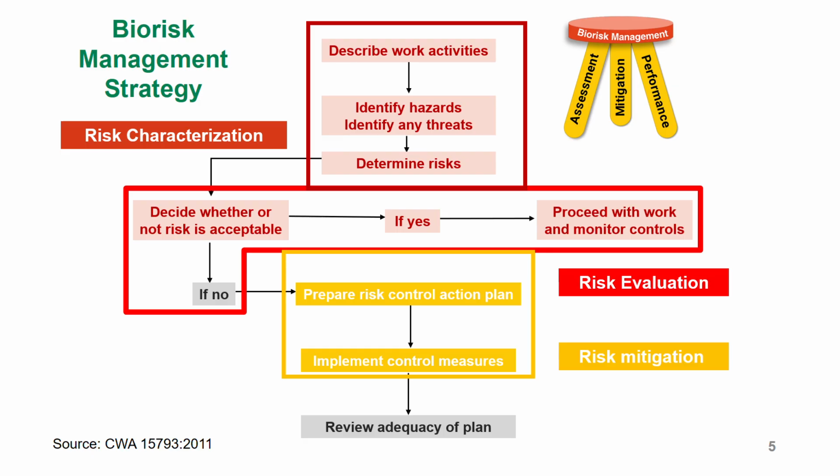So you check all those things, because sometimes you find that a risk control measure will fail because the people are not using the risk control that you implemented the way they are supposed to use it. So the risk control will fail because of maybe the people not understanding how they're supposed to use this new technology or this new facility.